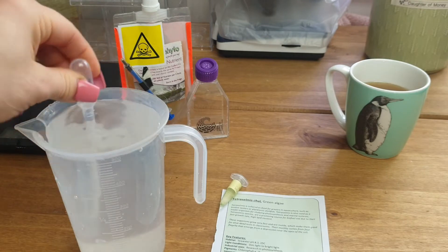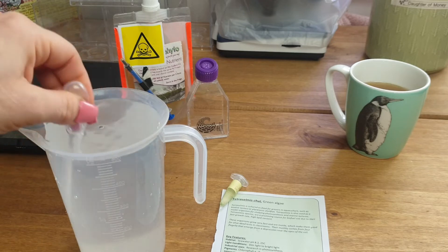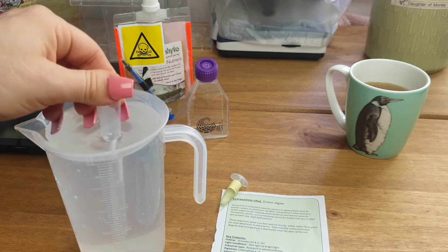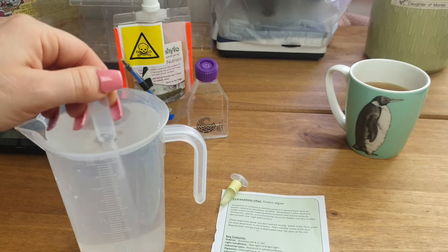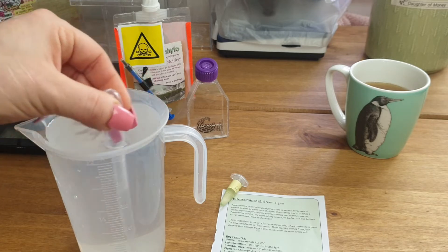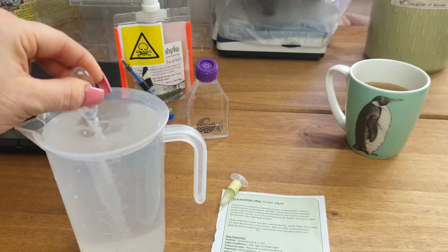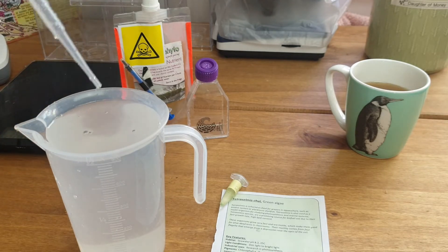Now we're going to top it up to the 500 ml mark with RO water — reverse osmosis water, which is a type of distilled water where the water has no impurities; it is just a blank canvas. I'm going to go ahead and fill this up now. I'll use my pipette to give it a little stir to help the salt dissolve. It may take a little while. If you want RO water at home, you can get it from your local aquatics store — they sell RODI water, which you can get cheaply and easily.